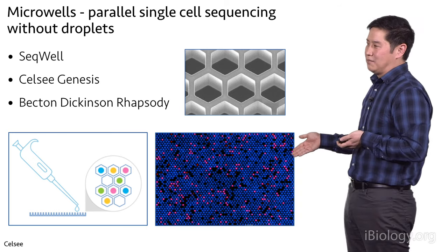And so there are a couple of non-genetic strategies that came out. The first one was from the same group that developed CiteSeq. They realized that if they use an antibody that binds to some type of universal surface antigen on cells, they could take that antibody and split it up into a couple of different aliquots, and for each aliquot, you can give it a different barcode. Then you can take your different samples and add them to these different aliquots of antibodies to allow them to bind. At that point, you can pool them all together, run them in the single-cell sequencing platform, and you look for the presence of which barcoded antibody showed up. And this will allow you to assign each of these individual cells to a particular starting sample because you knew which barcoded antibody was used for each sample.